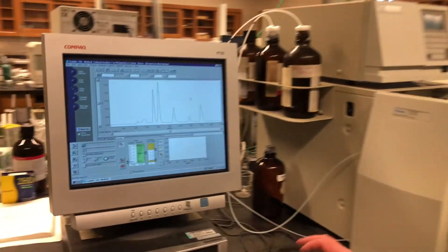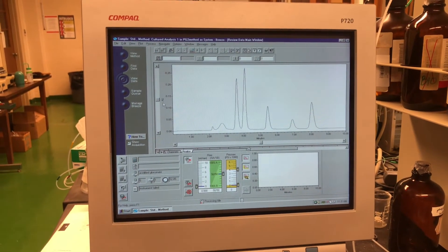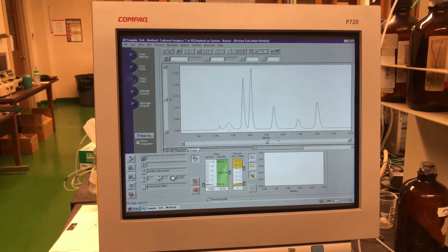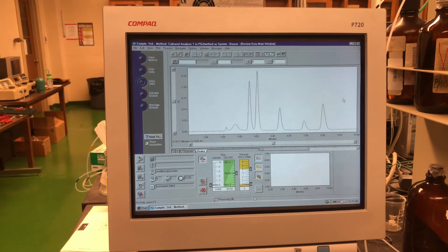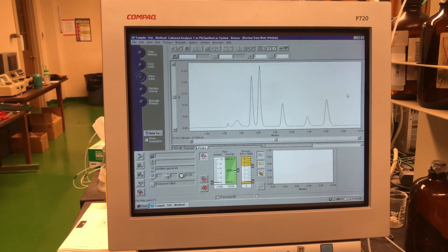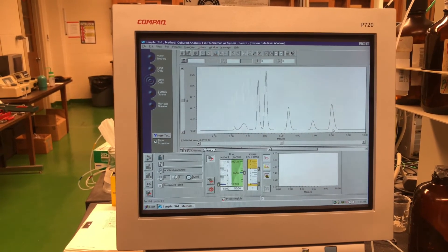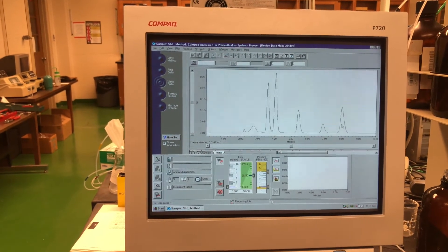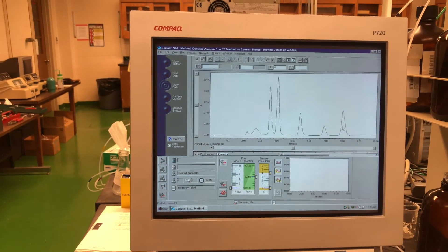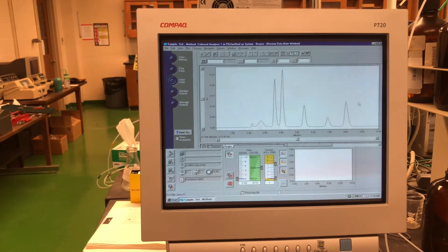We'd like to show you an example of a real chromatogram. Looking at the computer screen here, what we see is that we are plotting AU or absorbance units — a measurement of the amount of light being detected at our analytical wavelength for the organic acids — versus the retention time in minutes. In this example, we have five major components that correspond to five different organic acids that might be found in kombucha. Each individual acid elutes or comes off of the column at a specific time, so based upon knowledge of that time for a given acid, we can then identify that acid in a real kombucha sample. We'll also note that we have different heights or areas under each peak, and from that information we can obtain quantitative results to determine how much of a given acid is found in a kombucha sample.